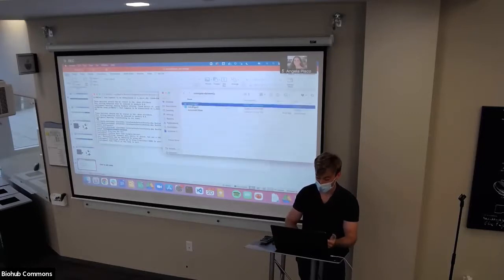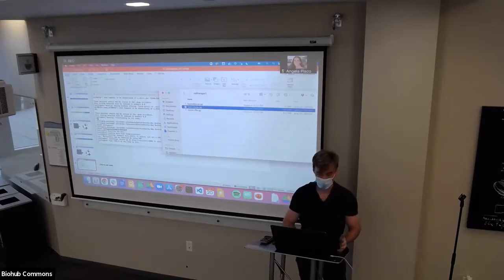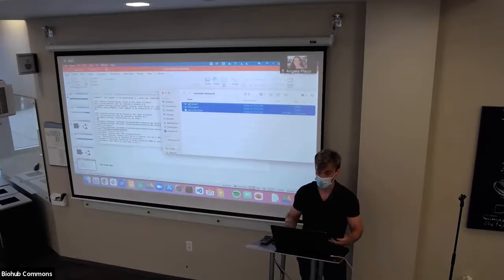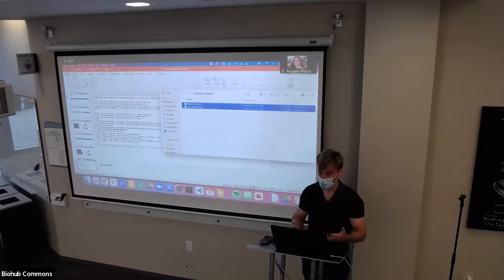For example, this folder called CellRanger1. This is the output of CellRanger, and the output always looks like this, where we have a matrix.mtx file containing the non-zero locations of your sparse matrix with all the counts information. It's just a compact way of storing this. You have a features vector saying what all the genes are named, and then you have a barcodes vector saying what all the cells are named. And you can feed it in this folder. You can even feed into cellxgene a folder with all these different data types mixed together. It'll automatically read them all individually, then concatenate them into one. So for this tutorial, what I fed in was just 2 H5AD files. These are annotations that cellxgene then at runtime loads and concatenates.